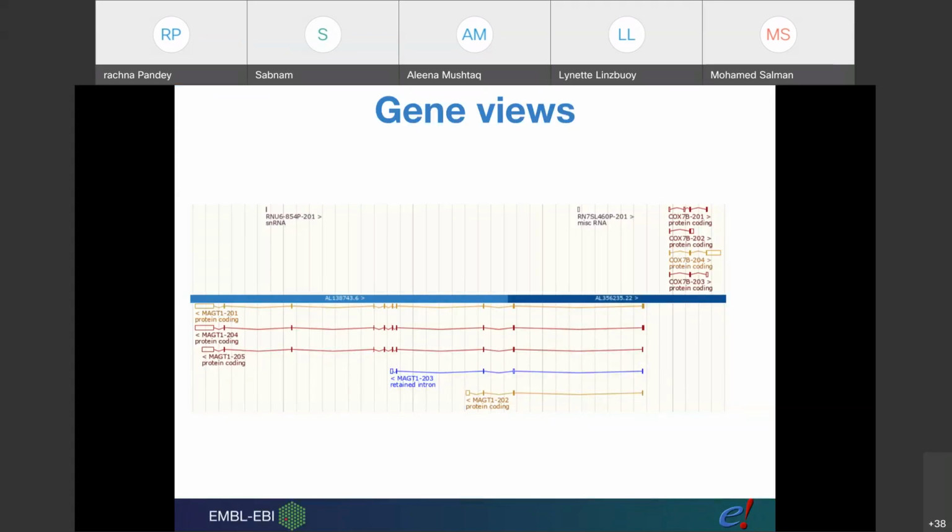I mentioned yesterday that a gene in Ensembl is a collection of alternatively spliced transcripts. And on my slide, I'm showing you a region in detail view, and we explored this view in our demos yesterday, and you must have come across it whilst you were doing the exercises. And on this slide, I have different transcripts of a gene. So as I mentioned, a gene is a collection of transcripts, and it's absolutely normal for alternative transcripts to be transcribed from a single locus.